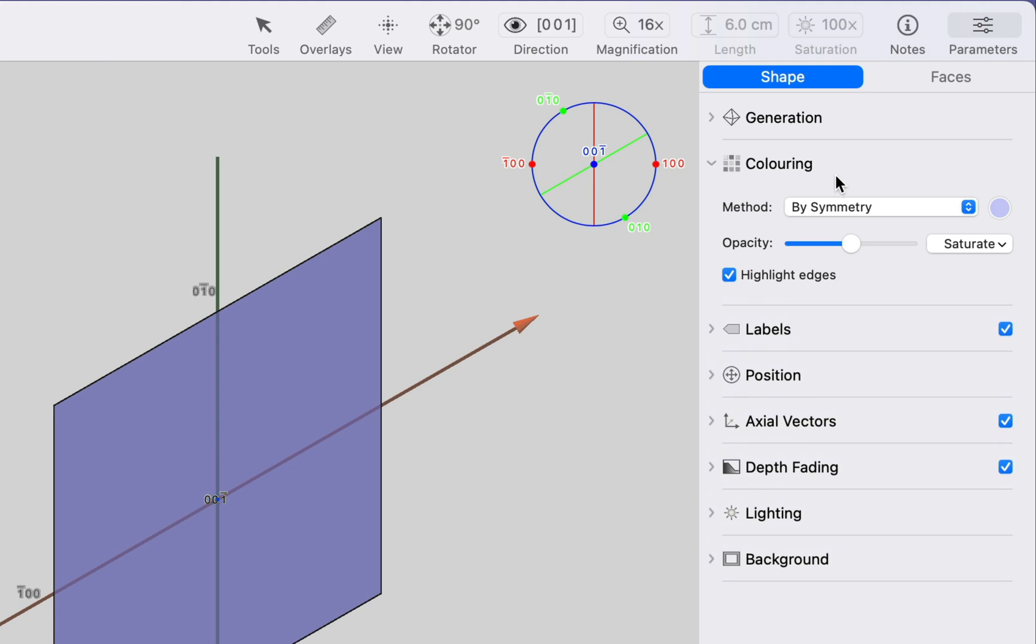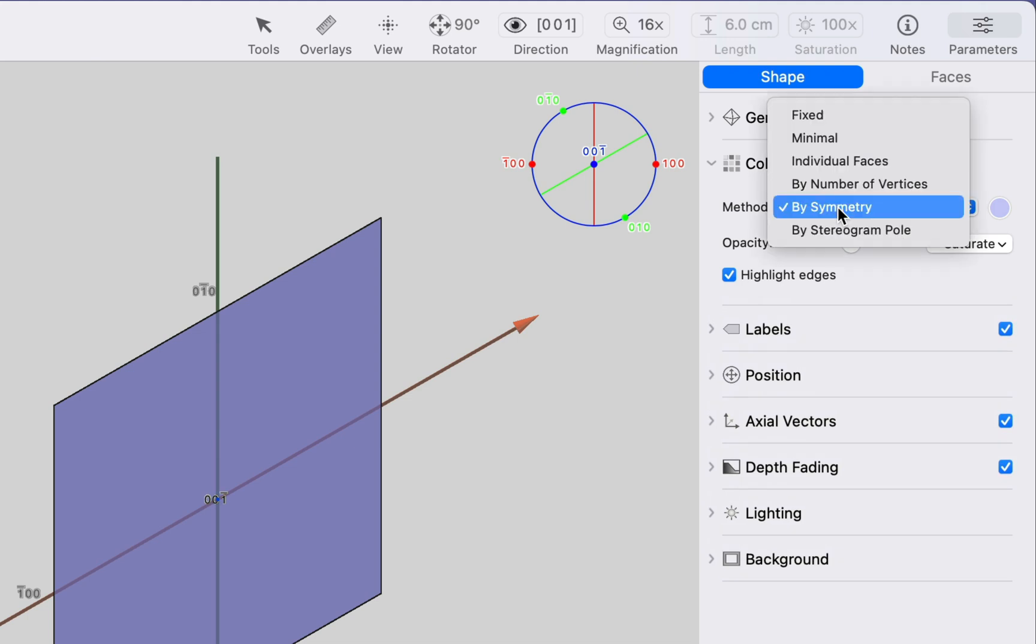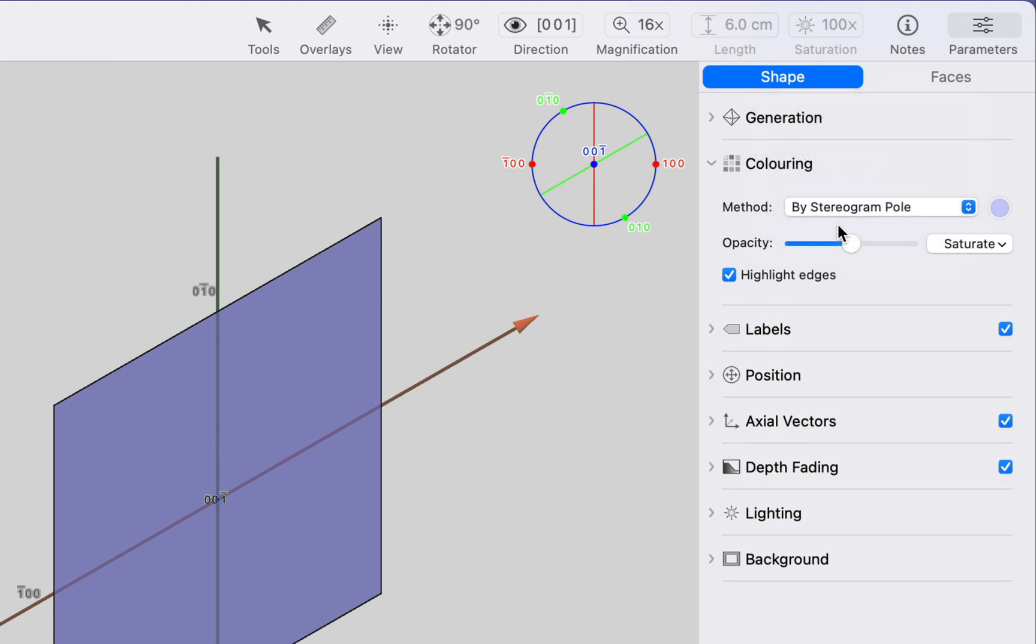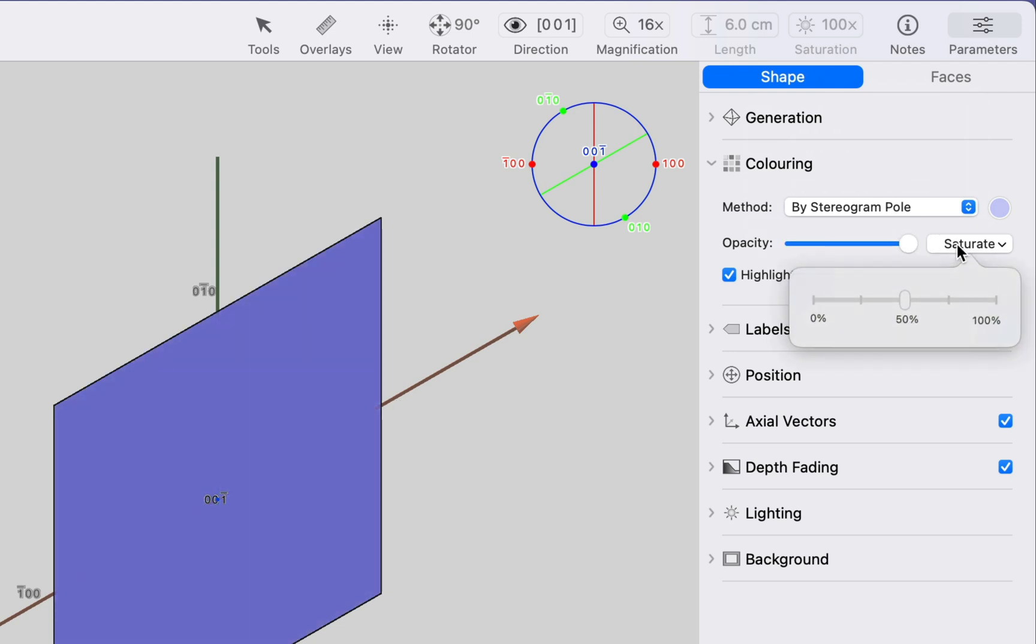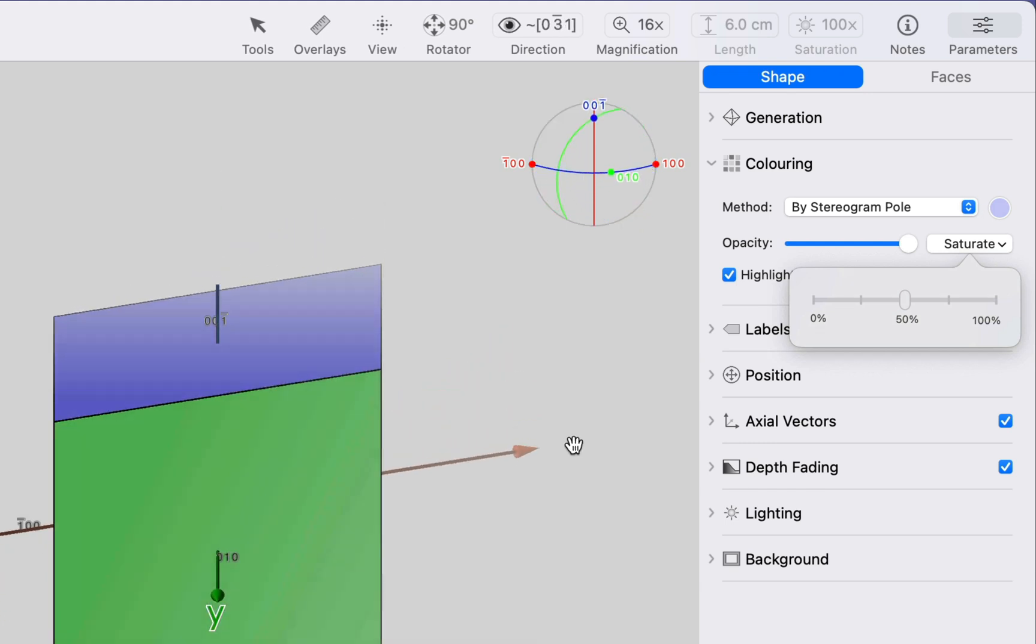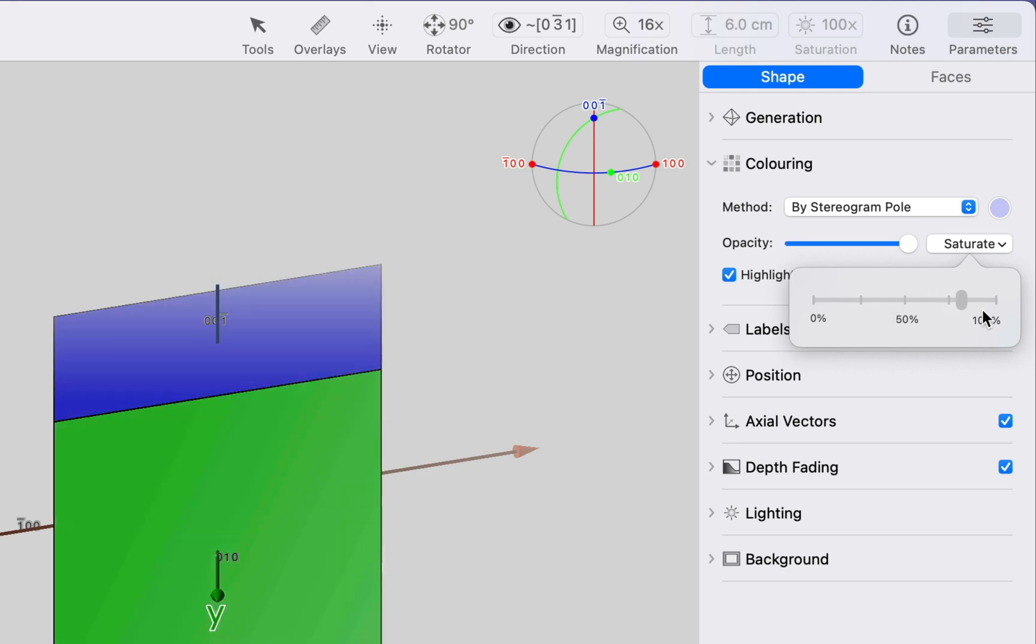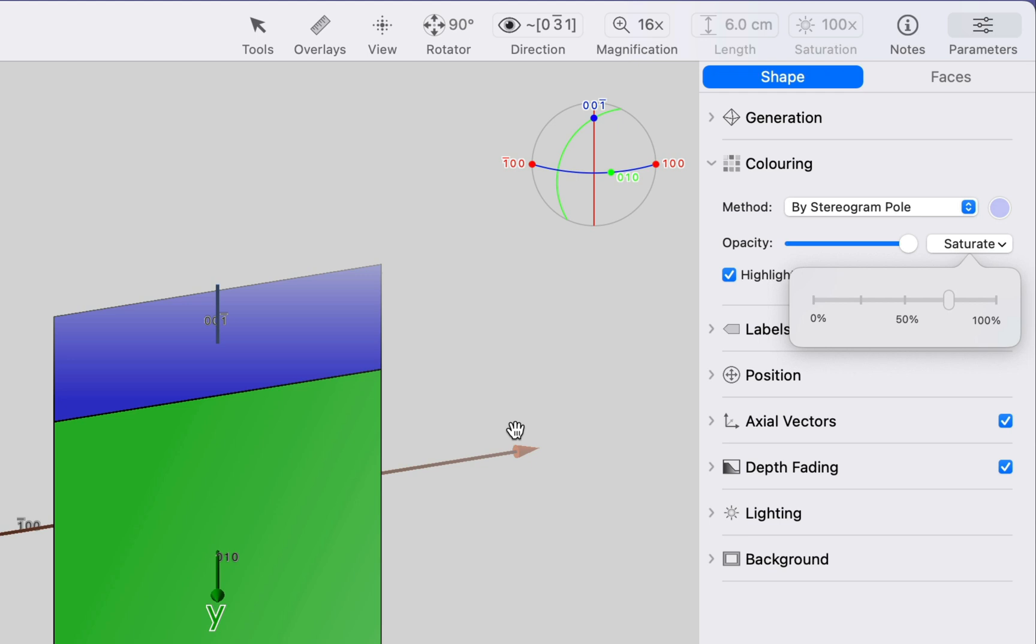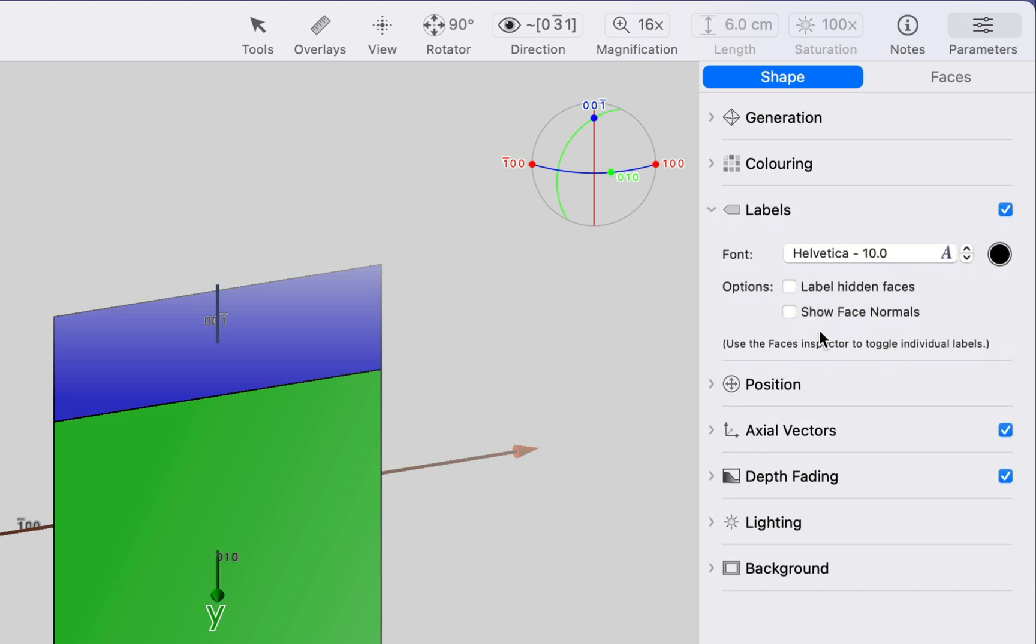We're going to go to the shape inspector and set a few things up before we start editing faces. Let's take a look at the coloring. I'm going to color by stereogram pole. I'm going to make my faces opaque. I can change the saturation. Let's go for something in between. And we can also label our faces. Let's make the labels nice and big so we can see what we're doing.